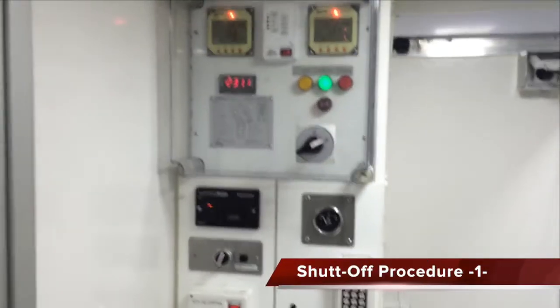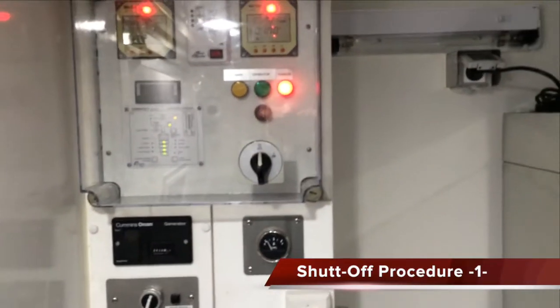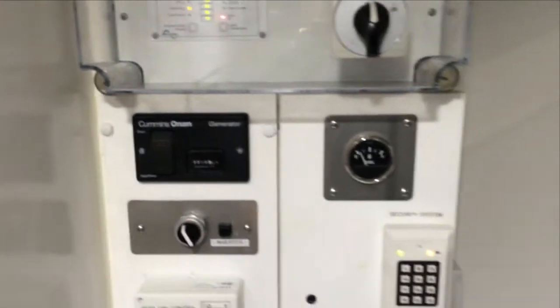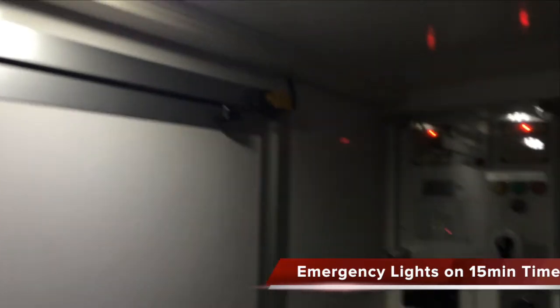To shut down the lab, simply turn off the master disconnect. I now have just the inverter running. I'll put it into travel mode and shut off the inverter. Emergency light system on 15-minute timer.